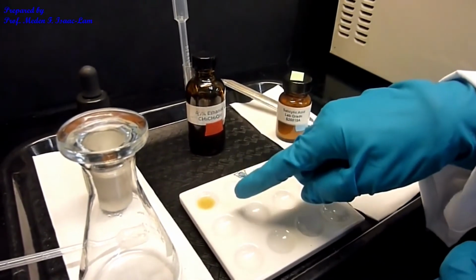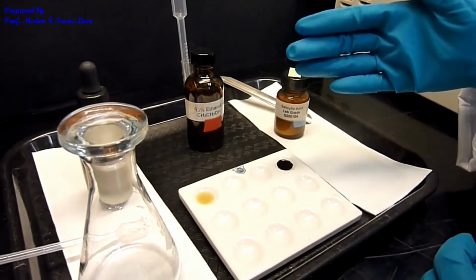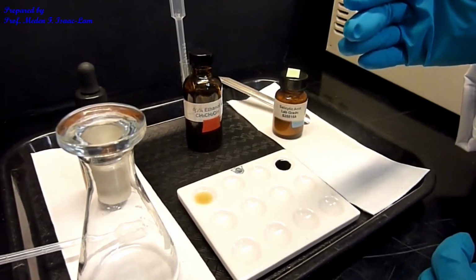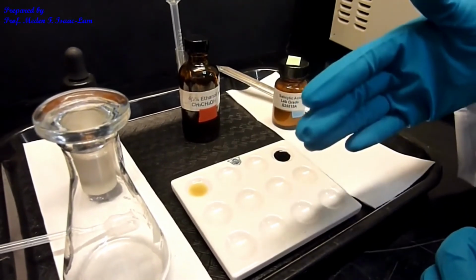However, for our reaction mixture, because the OH in salicylic acid reacted, it was converted into another functional group, actually an ester, then it will not turn purple because there's no more free phenol in the reaction mixture.